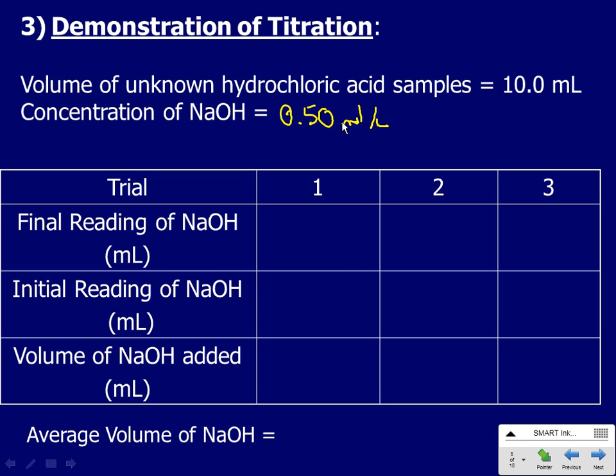Run some through the tip, right? Close that, rotate, rotate, and open the tap so that the liquid can drain out of the tip. All right, close. So that's a cleaned burette. I'm going to move that. We don't want it in that way.